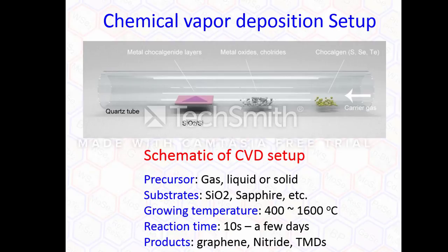All right, so this is melting, this is nucleation. Once we have a good metal precursor and chalcogen precursor, and we find a good temperature window, like 600, 700 degrees, they meet together at the substrate, we have a lot of nucleation. What will happen? They will react, right? And they grow, slowly or fast? If they grow slowly, you will have like a flake, and the grain size will be very small.